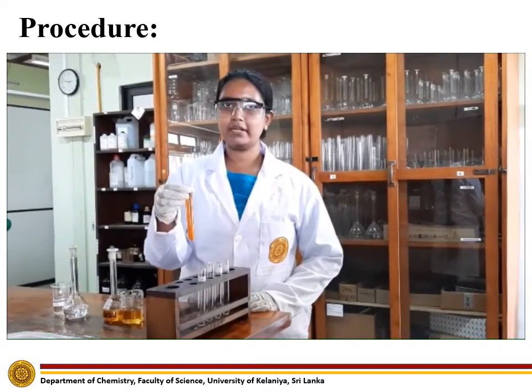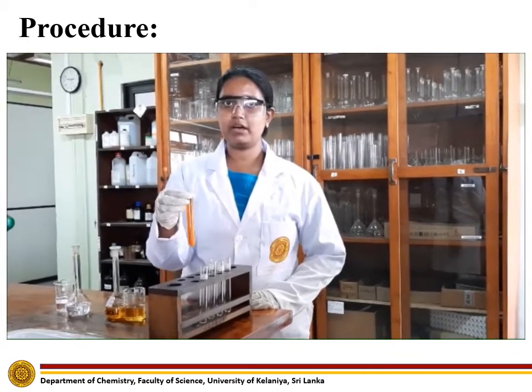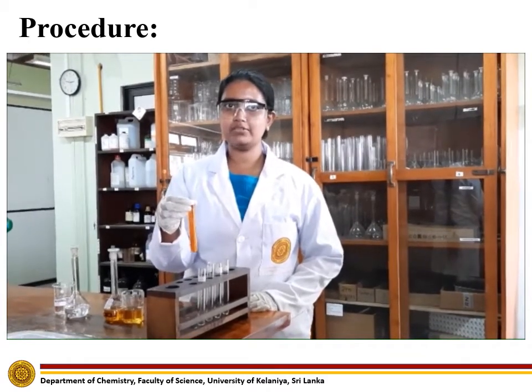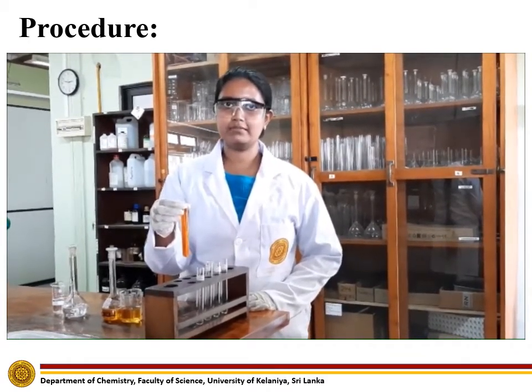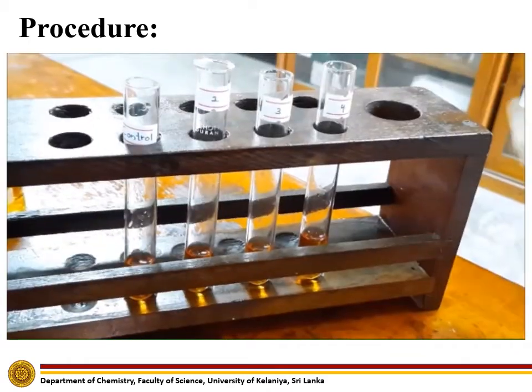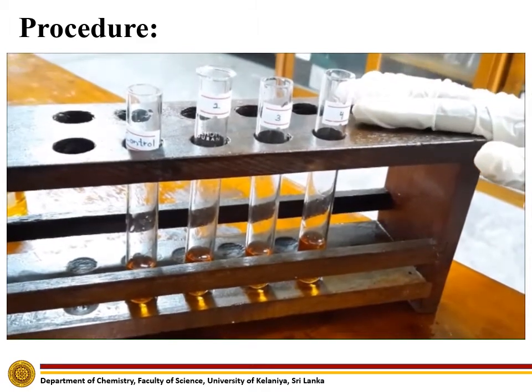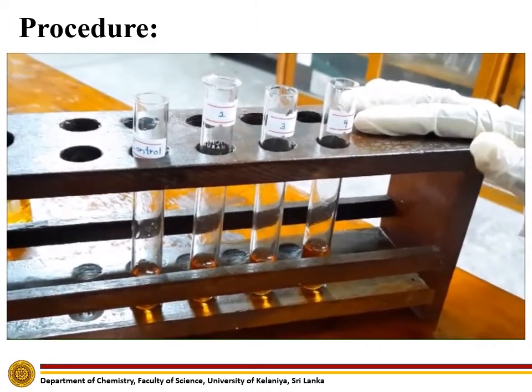Now let's divide this solution into 4 parts, including the control test. These are the prepared test tubes.